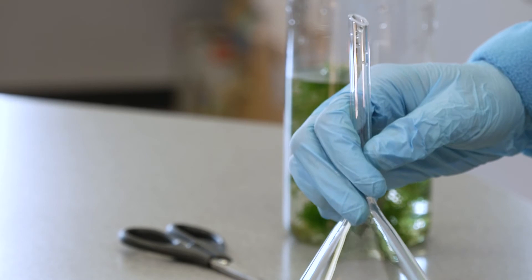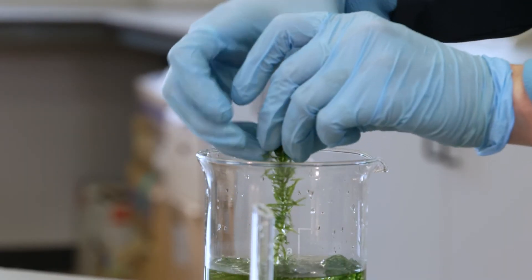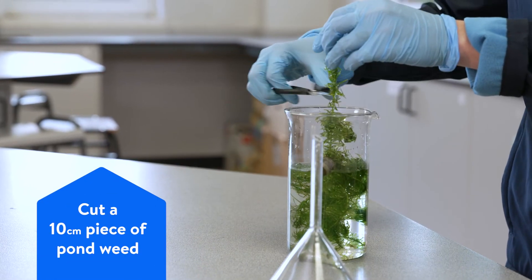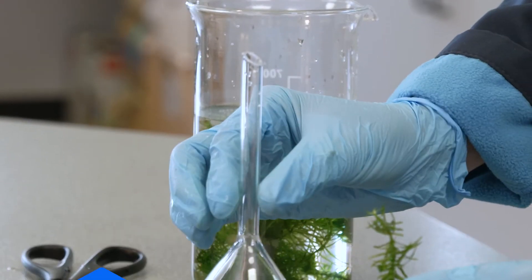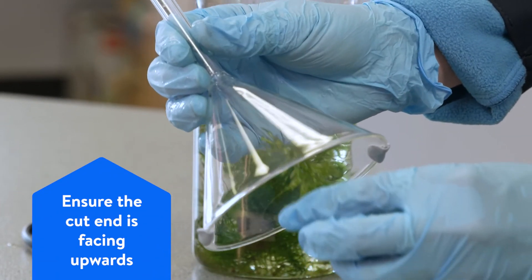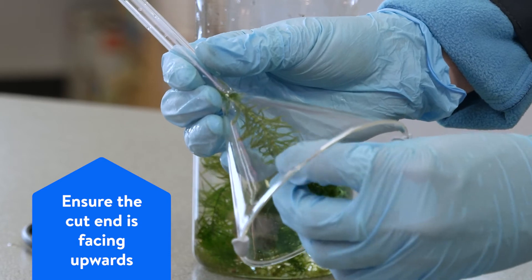Cut a 10 centimeter piece of pond weed and place this in the filter funnel, and try to ensure that the cut end of the pond weed is facing upwards. Then place the filter funnel containing the pond weed into the beaker of water.